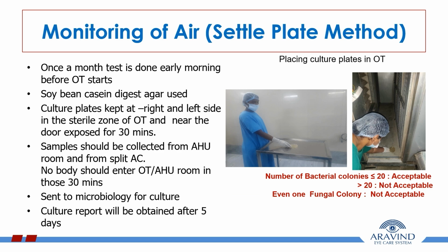Send it to microbiology for culture. Culture report will be obtained after 5 days. Number of bacterial colonies less than 20 is acceptable. More than 20 is not acceptable. Even one fungal colony is not acceptable.